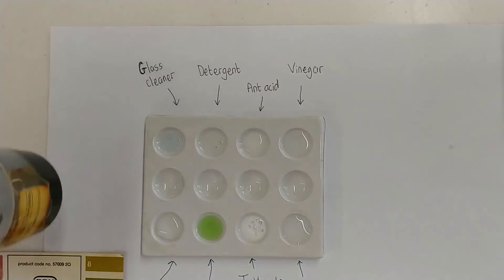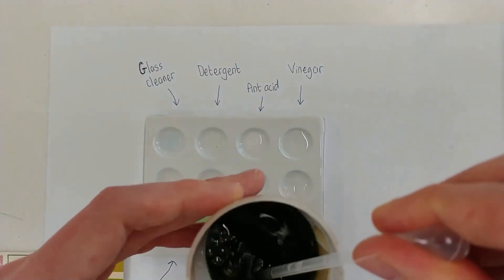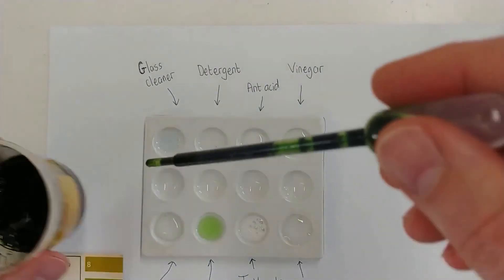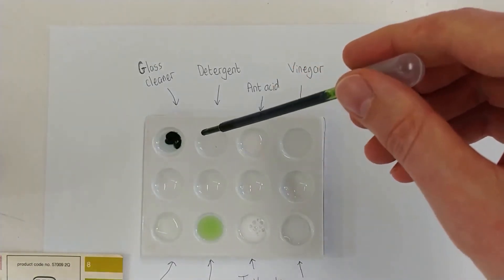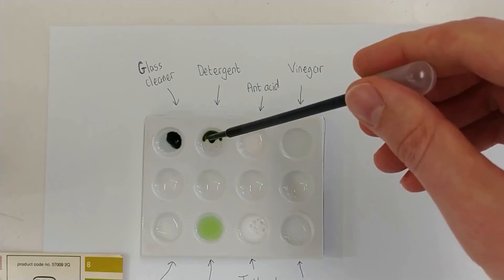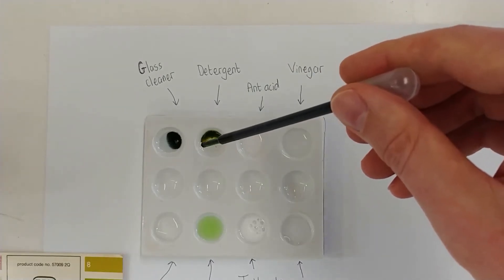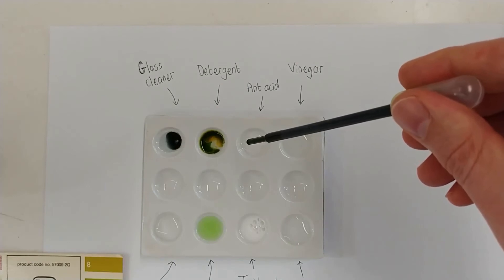Ah, at last, he's finished. And now the Universal Indicator solution, which as you can see has a very deep green color. And here, a few drops go into the glass cleaner. The detergent. Yes, that's right, just one more.